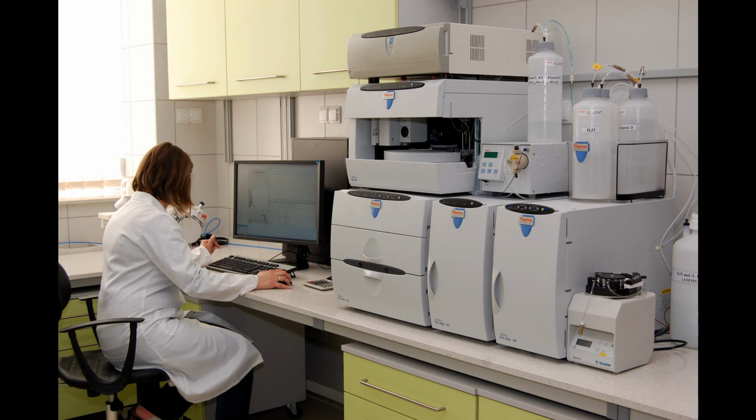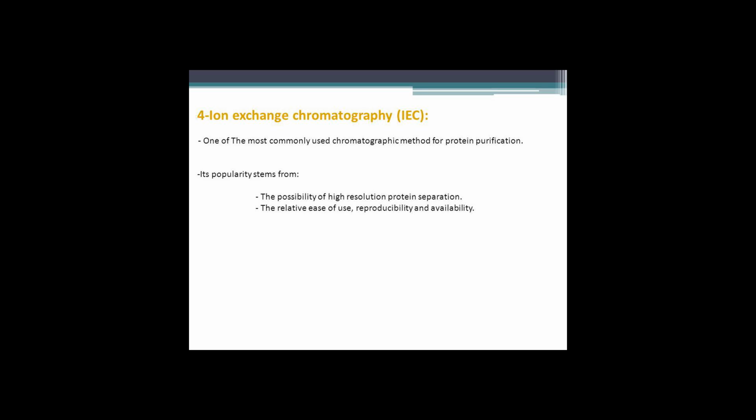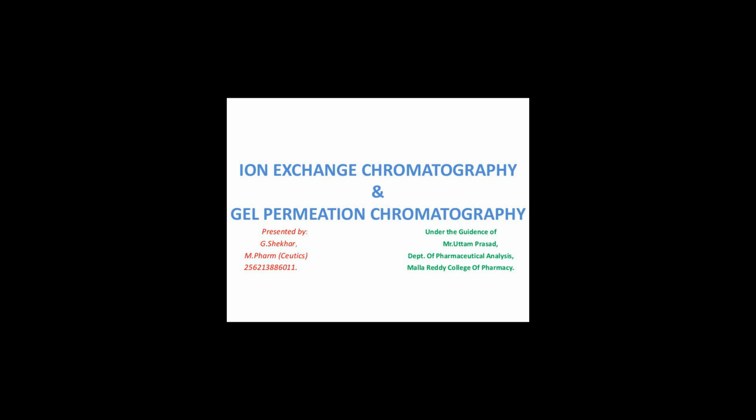At the isoelectric point, pI, the total charge on the protein is 0 and it will not bind to the matrix. If the pH is above the pI, the protein will have a negative charge and bind to the matrix in an anion exchange column. The stability of the protein at values above or below the pI will determine if an anion exchange column or cation exchange column should be used.